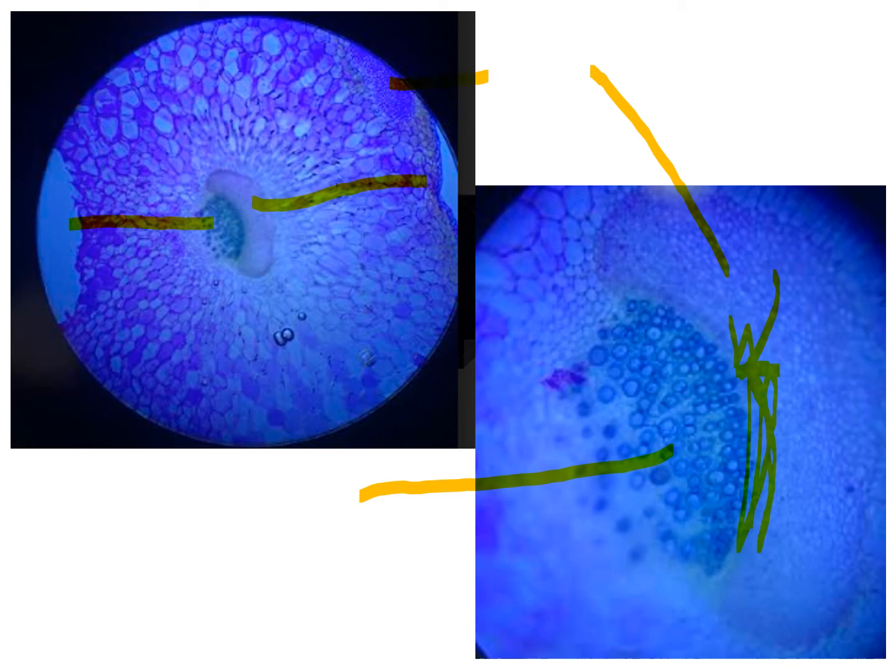And here you can see some collenchyma. It forms little bean shapes, kidney bean shapes. And it's the stringy stuff that makes celery really tough to chew and eat. And so sometimes if you cut through celery and you don't cut through it properly, you can pull strings off the outside, and it's that collenchyma that you are pulling strings of.